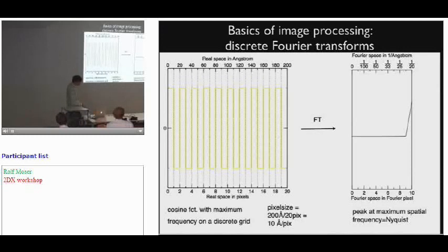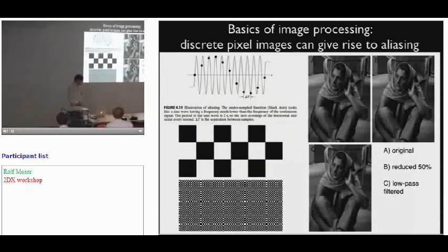There is one other important consequence. If you're working with discrete image quantities, you can also run into a situation that's called aliasing. Basically, it means that if you have a very high frequency sine wave, and your function is undersampled, so you can only take image quantities at every other frequency, you can actually generate a new, much lower frequency that is basically an artifact of the system.